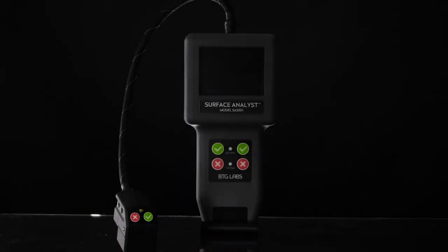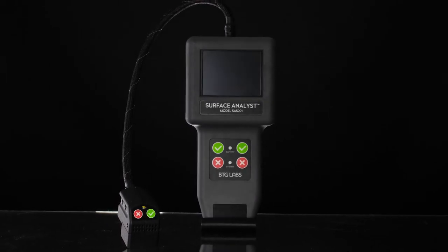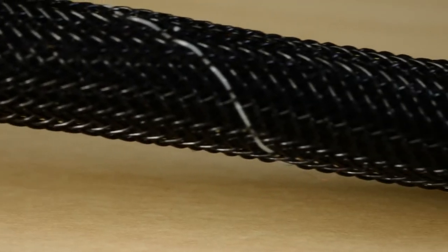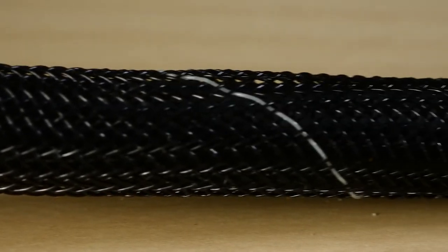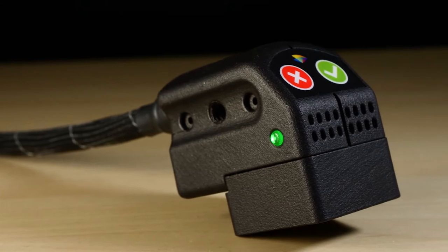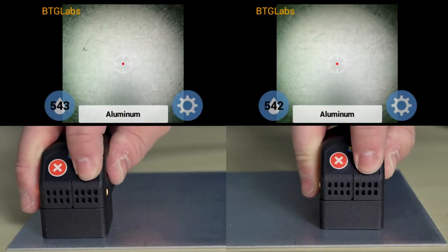The Surface Analyst 5001 collects critical data about your material surfaces in real-time. The device delivers repeatable, consistent, and rapid quality measurements on real parts and real-world surfaces, making it the smart choice for surface testing and manufacturing.